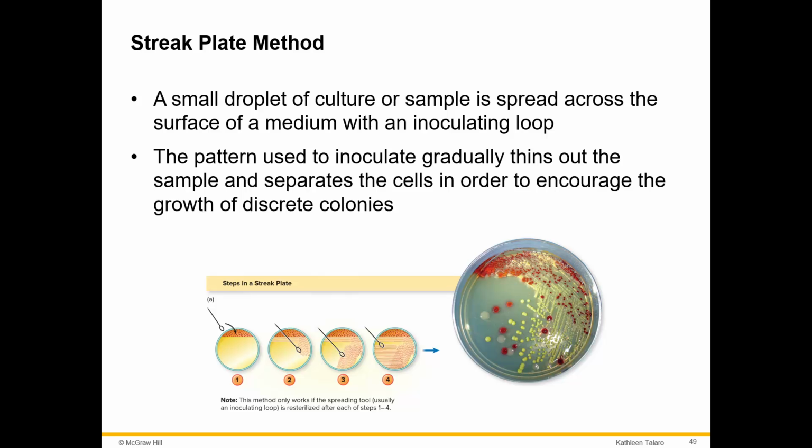We can start to examine what the bacteria on the surface look like to try to figure out which one is the pathogen and which one is the normal biota, the normal natural bacteria that's in the background. So isolating allows us to identify and diagnose a patient's infection.